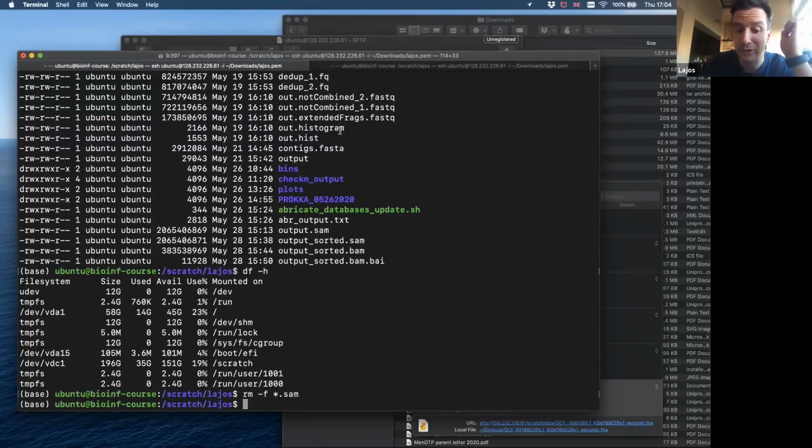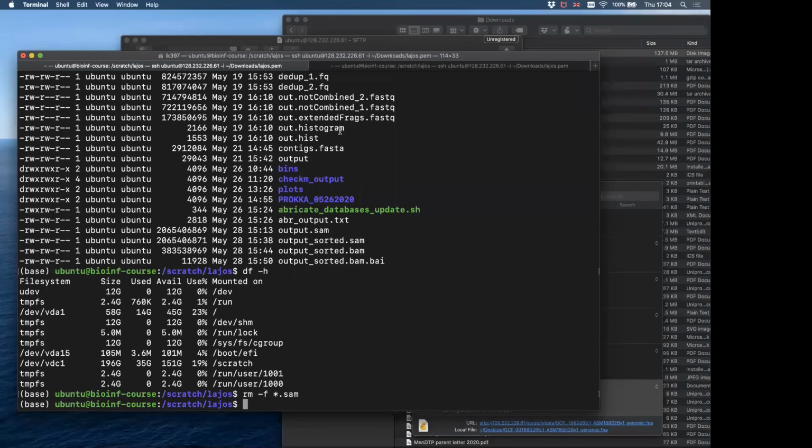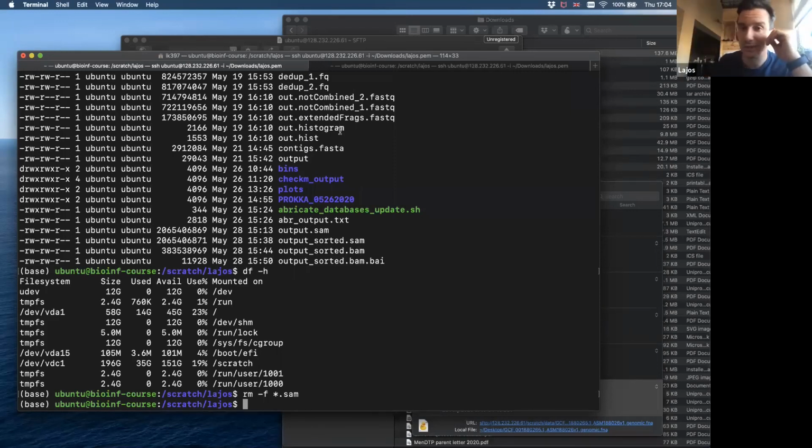It will also be interesting next time because we will do an automatic variation calling. So instead of looking for SNPs or insertions, we will apply a program that is going through the BAM file, comparing it with the reference sequence, and giving you a list of the potential variants. Okay, and then if we see something interesting, then we can go after that. And I really hope that the BAM view will be also much nicer than this.